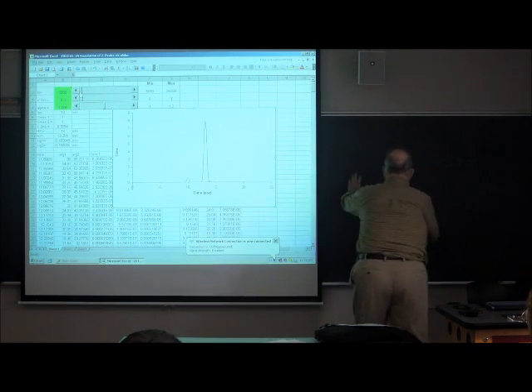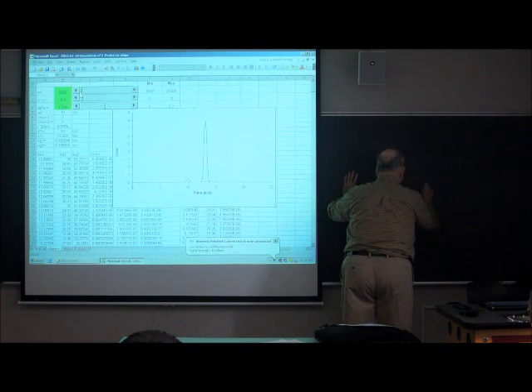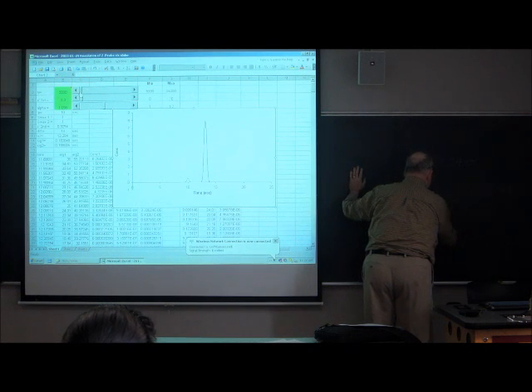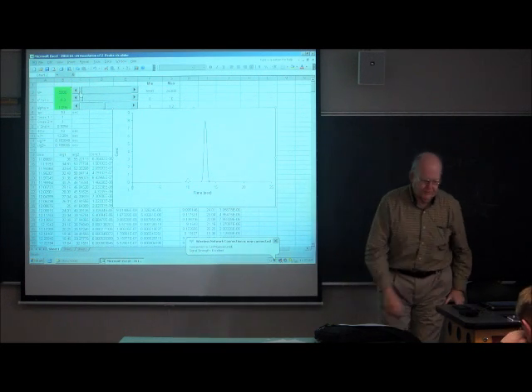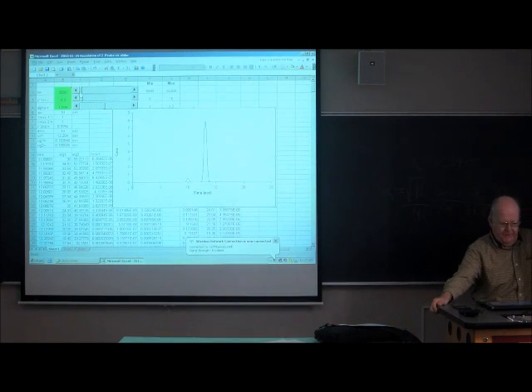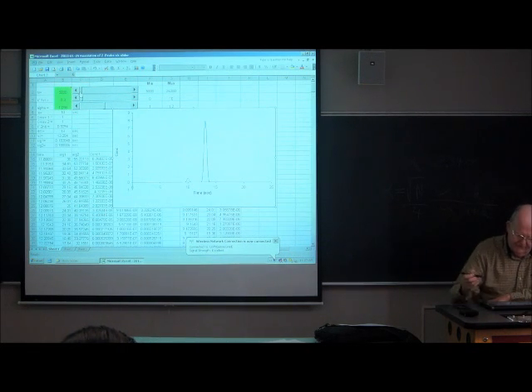So remember, that's what we're calling the general resolution equation, or the Purnell equation.